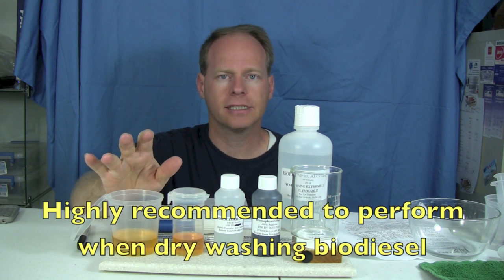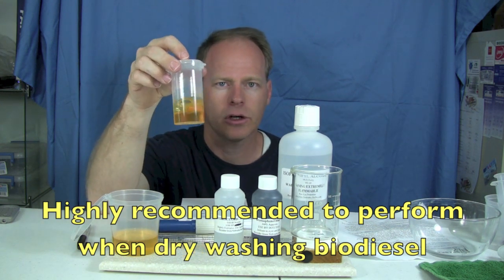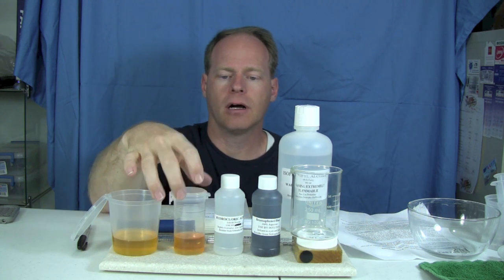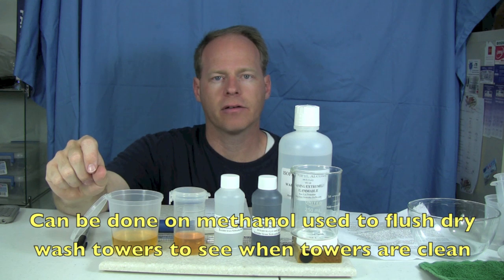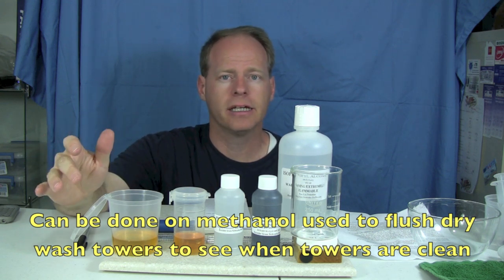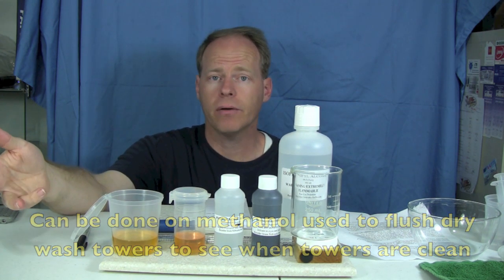If you're dry washing, this test is extremely important because it's very difficult to detect soap in biodiesel just by looking at it. Also, this test can be done on recovered methanol out of dry wash towers to see if you've gotten the dry wash tower clean. Basically, once the methanol has no soap in it and you're flushing your towers, then your towers are clean and ready to go again.